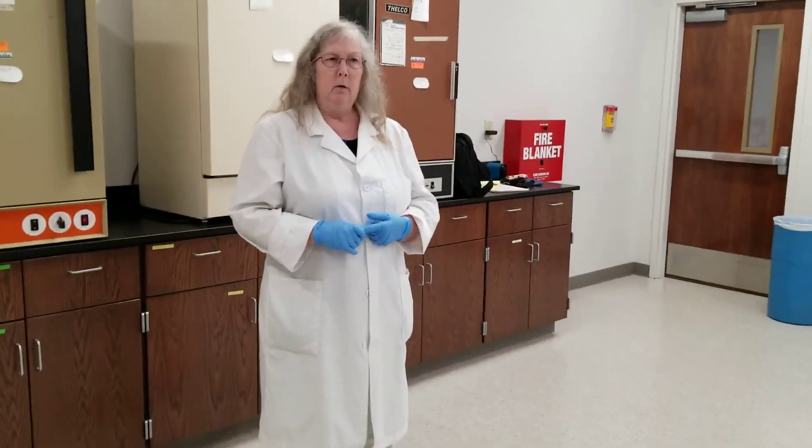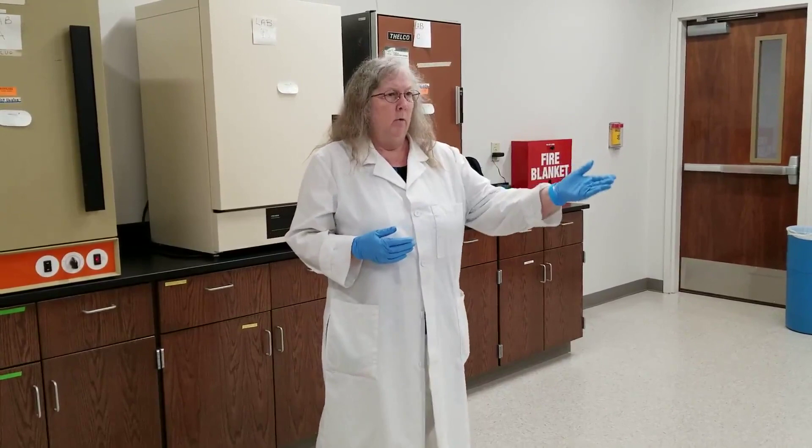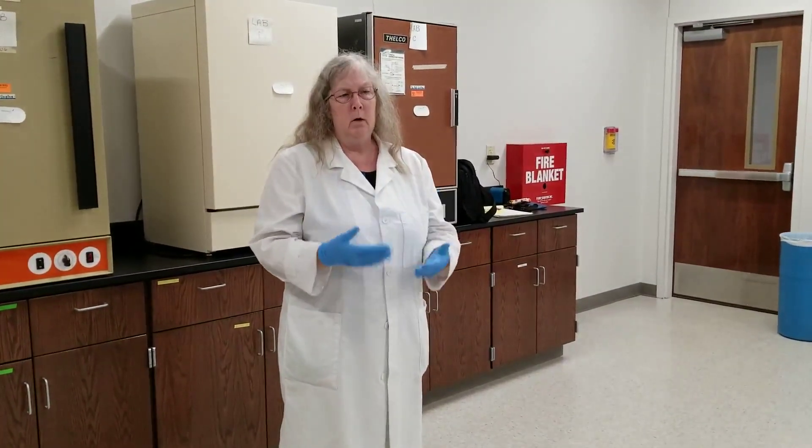Any accidents, should they happen — hopefully not — you need to notify me immediately so we can deal with the situation. Most accidents, if they happen, are often due to people getting careless, not using common sense, or overcrowding their lab area with supplies. That's why it's so important to keep your work area clean and only bring out what you need — common sense. No horseplay, no running in the lab.